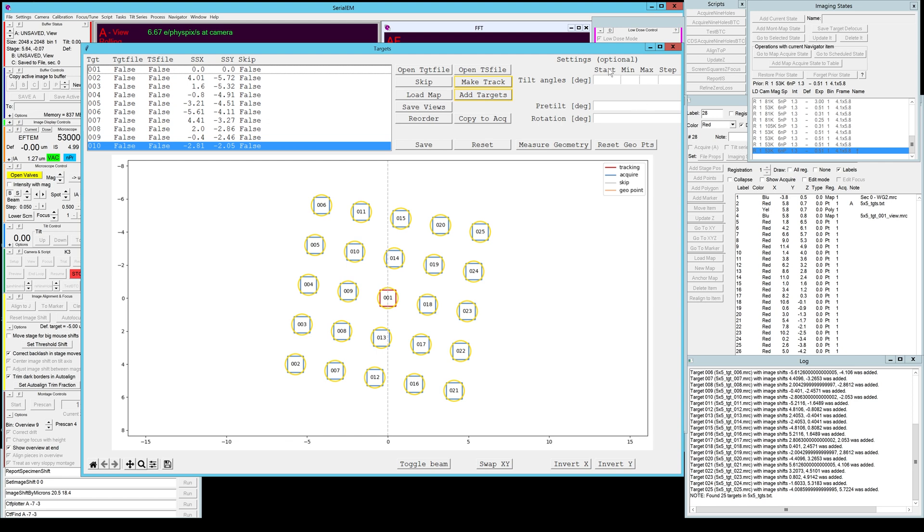Let's just quickly go over these settings again. If you want different tilt angles, start tilt, min tilt, max tilt and tilt step for different target areas you can specify them here.